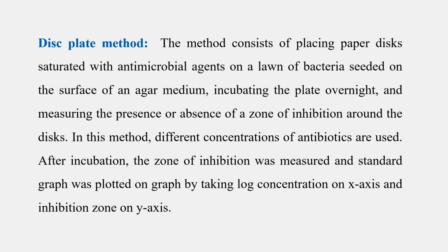In this method, different concentrations of antibiotics are used. After incubation, the zone of inhibition is measured and a standard graph is plotted by taking log concentration on the x-axis and inhibition zone on the y-axis.